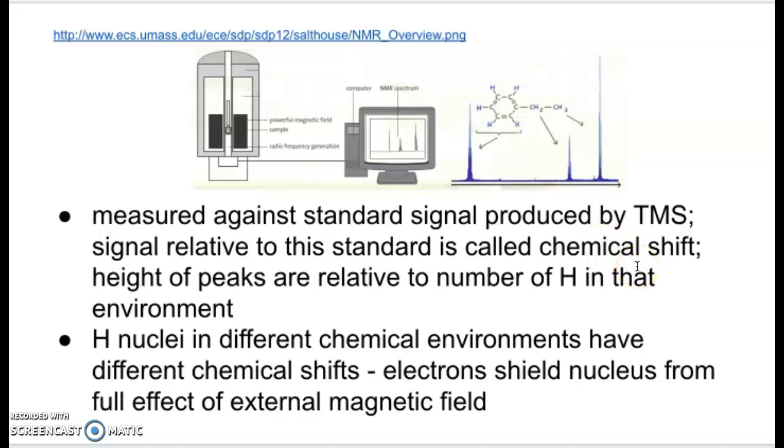The one big caution about NMR that I give students, and I really wish it's specifically the IB curriculum that goes way overboard on this. In that purple handout, which is supplied by IB, it actually talks about specific chemical shifts for different hydrogens. I find that information to be completely useless and not at all helpful for the exam questions. So if it says it's a 0.9, then that means it's a CH3. Probably not. Like that really doesn't tell you anything.